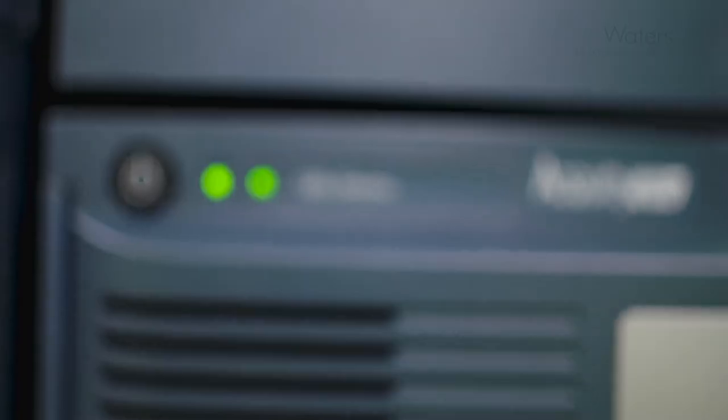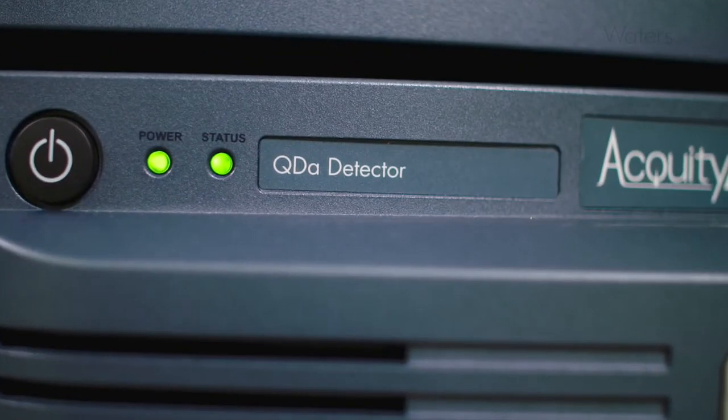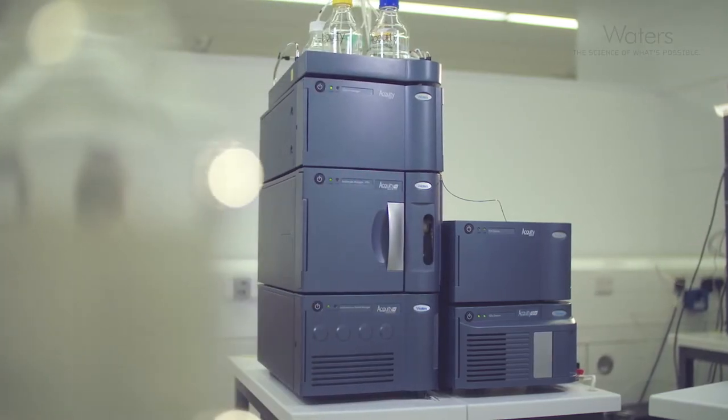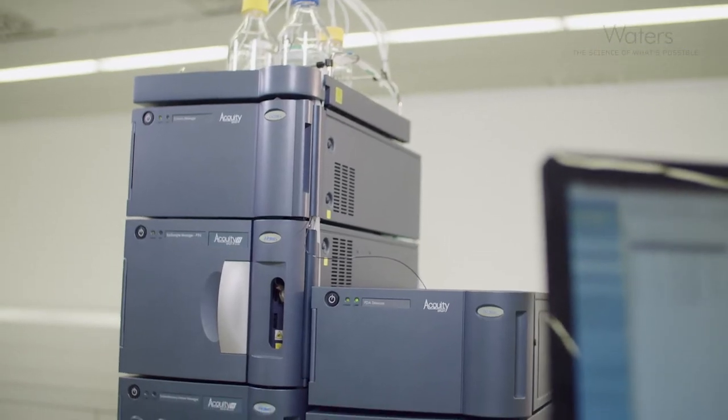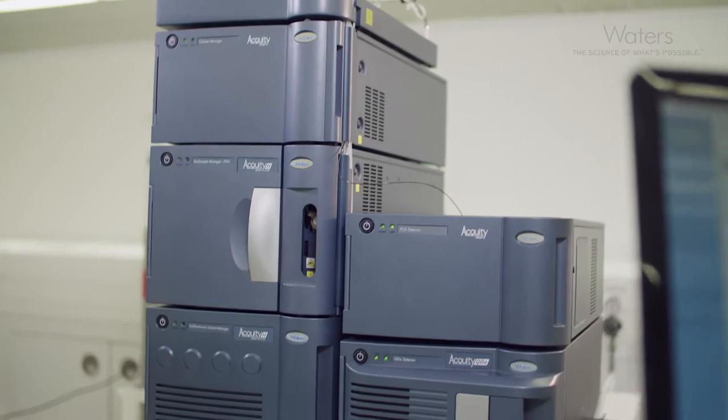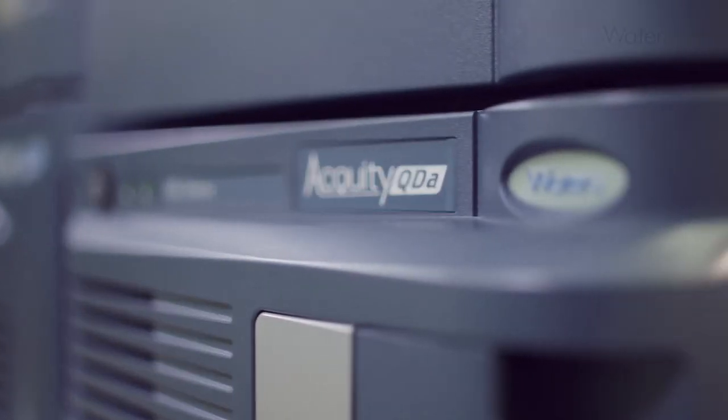The Acuity QDA detector was introduced a few years ago. It was released specifically based on requests from our customers to provide them with a small detector capable of producing mass data for the chromatographer. We believe it is the most compact mass detector on the market, and we certainly know that it's been the fastest selling mass product ever in our history.